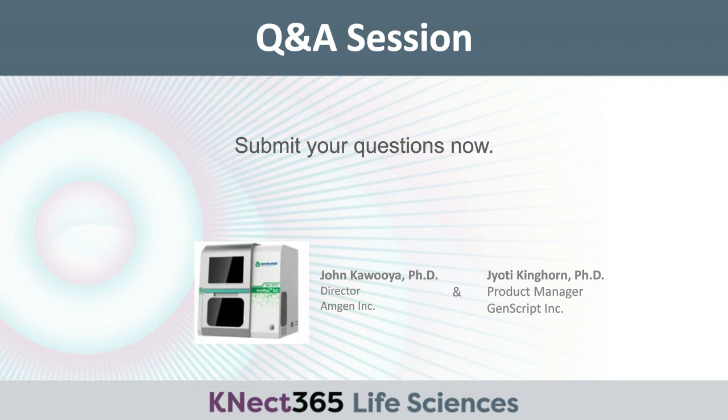Sure. I wanted to add. Oh, go for it. Yes. So for AMMAG SA, we show the scalability up to 50 ml. And as John showed in his slides, they have tested the scalability up to multiple liters, 50 liters, even maybe more with wave bags. So in case we cannot connect to him, they have tried this technology at larger scales. And as far as the commercial viability is concerned, we're working to make them commercially available.